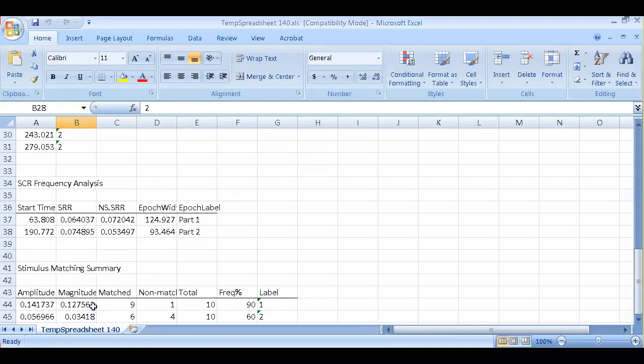And we have this table here that gives us the amplitude and the magnitude, as well as the frequency of response to the different types of stimulation. And the amplitude is the average of all specific skin conductance responses. The magnitude is calculated when we take all stimulus presentations and we average the non-responses, which are 0, and the responses as well. And we also have the frequency. So this gives you a very good picture of the type of responses we got to these events.